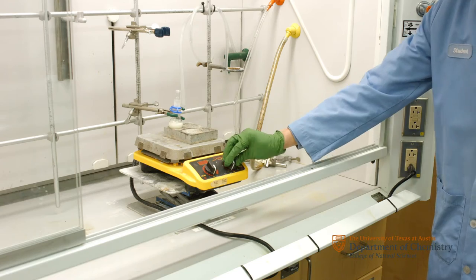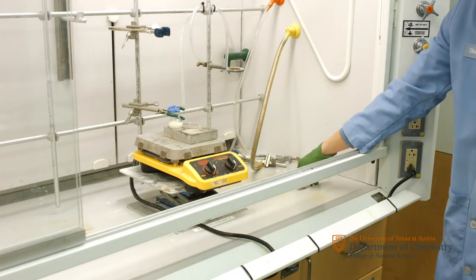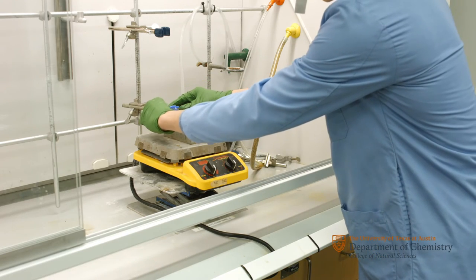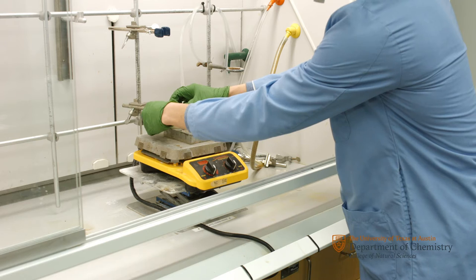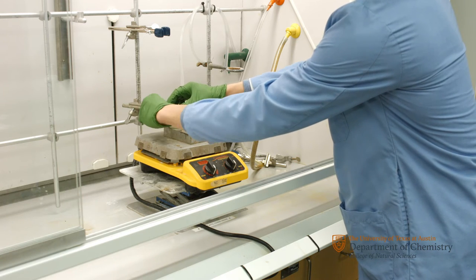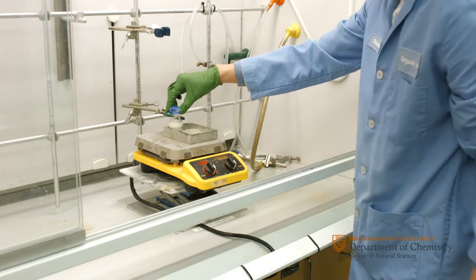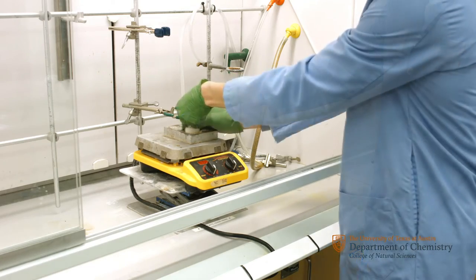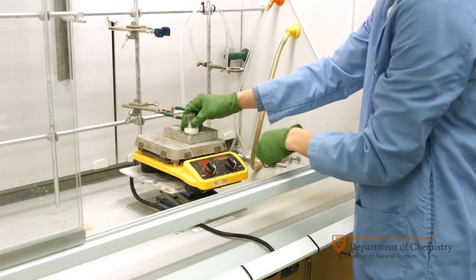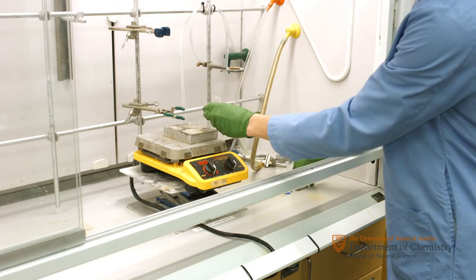Once the reaction is over, turn off the stir plate. Remove the stopper. Now carefully unclamp the flask and remove the Keck clamp. Now place the stopper back onto the flask and get ready for the vacuum filtration.